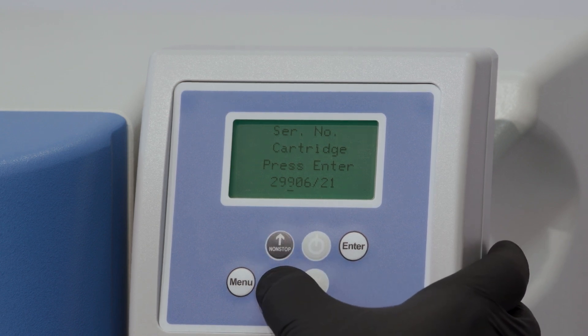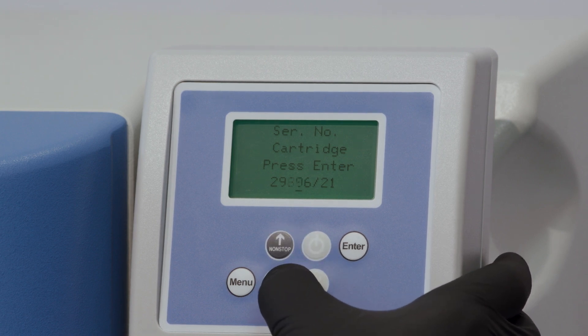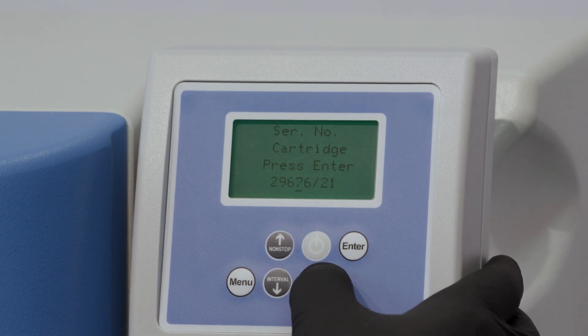Then use the UV button to go to the next value. When you're finished, press the enter button to save the new serial number. You can only use a serial number once.